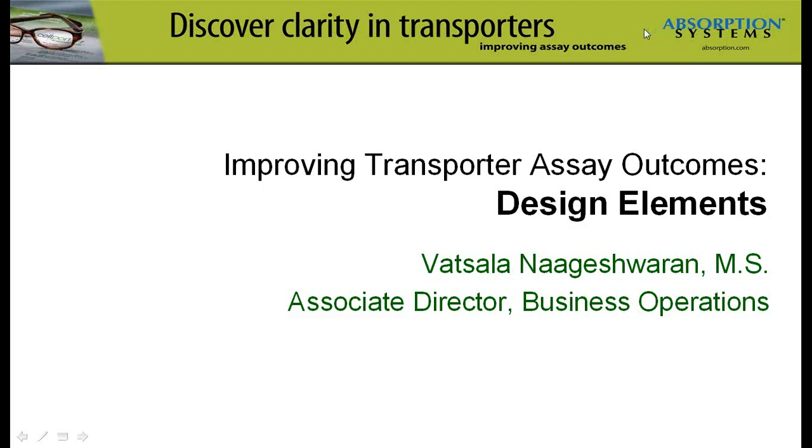The objective of this presentation is to focus on the importance of some of the variables in study design that can impact experimental outcomes when evaluating drug-transporter interactions. The aspects that will be covered include probe substrate, inhibitor, and assay format, which are typically the core elements of any in vitro transport assay. As we go along, I will show you why these variables are important through a format of presenting a consideration or challenge, possible solutions, and a case study example for each. This will be provided for efflux as well as uptake transporters and assay designs.